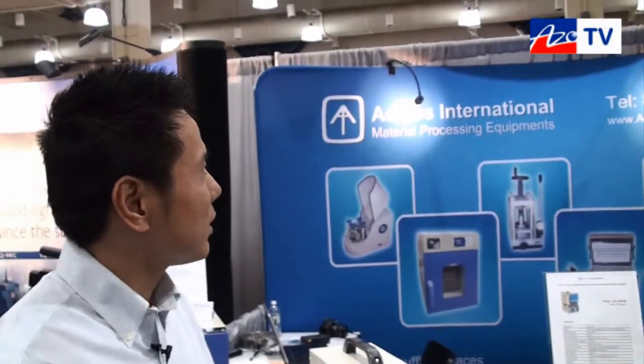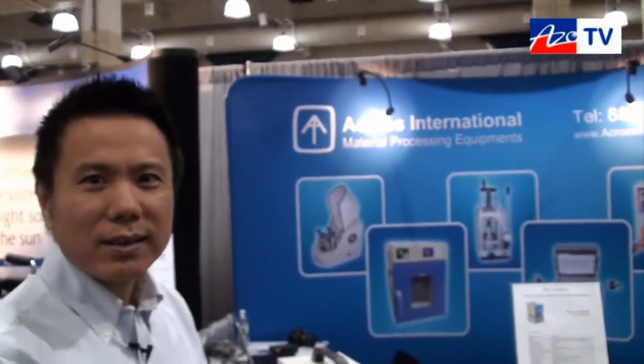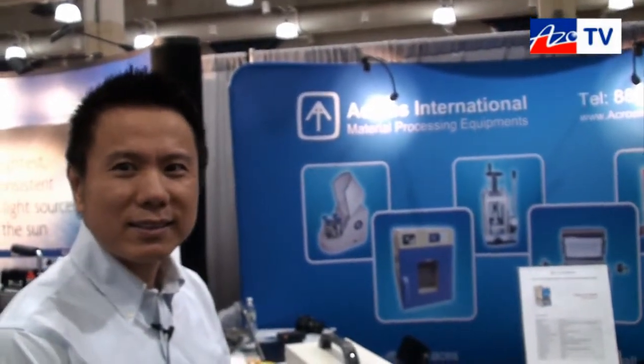If anybody wants more information about the IH15A induction heater, they can find that on your website. You can go to www.acrossinternational.com and find all the information online. Thanks for taking a few minutes to talk to us about the IH15A induction heater.